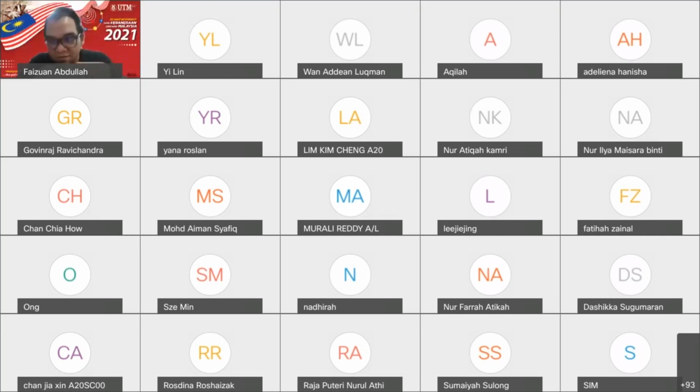Just calculate it. M1, V1, M2, V2. What is my M1? My M1 is 1000 ppm, my initial concentration of the stock solution, right?